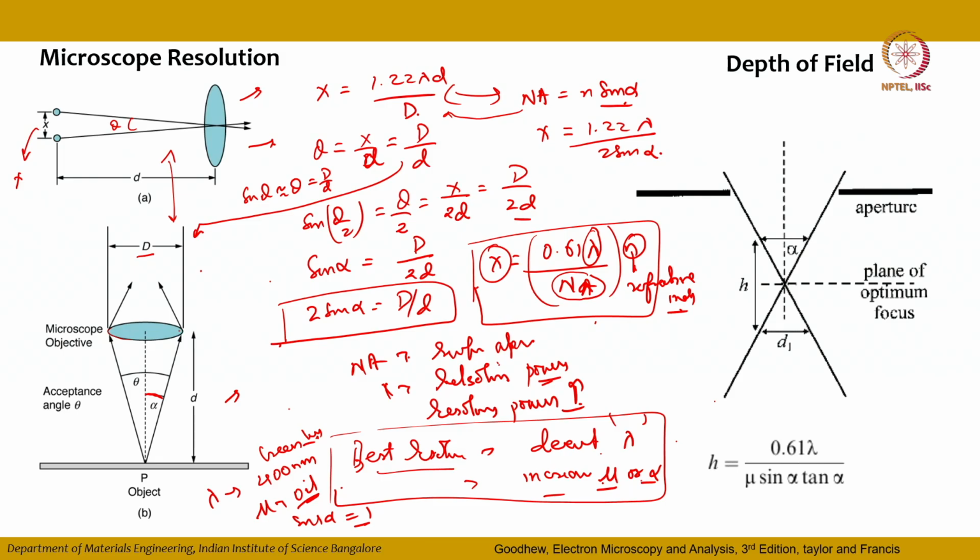Okay, so I hope that now you have understood the basic concept related to resolution. And this particular concept is the same for all microscopes, even the optical microscope and the electron microscope.